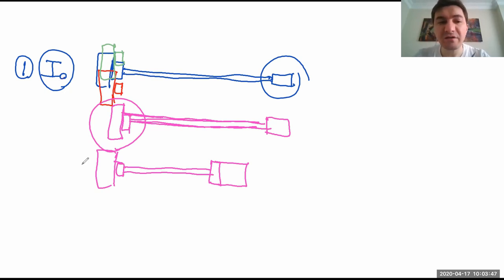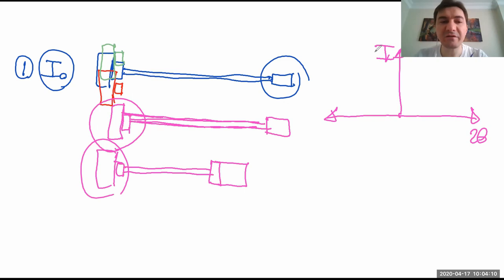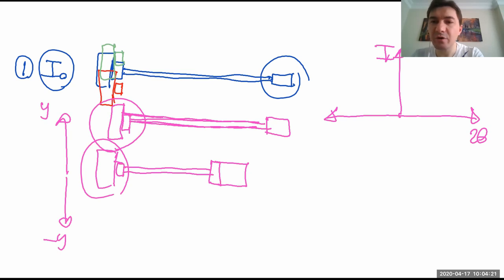In order to check whether the position of the detector is correct or not, we are doing a 2-theta scan. So what is a 2-theta scan? Here we have the 2-theta axis, and here we have intensity, the intensity read by the detector. Let's consider that this direction is positive Y and this direction is negative Y. Just consider, okay? If you move the detector in that direction, what do you see? If the whole intensity, all X-rays, goes to the detector, you should have huge intensity here, the direct beam.